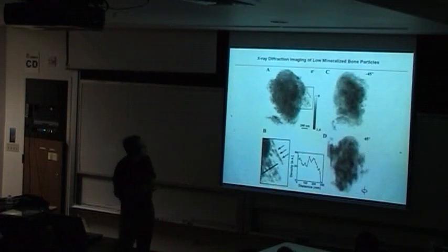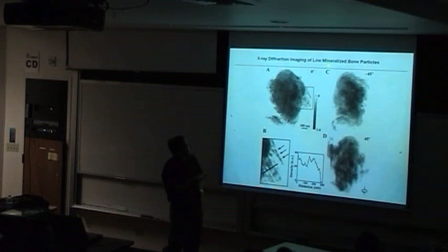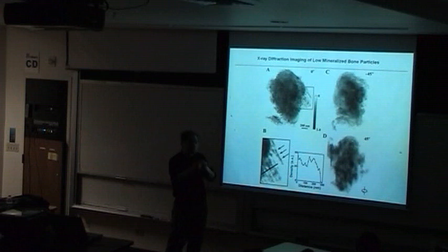We studied X-ray diffraction imaging of a fish bone, herring fish bone, at different stages. This is young fish bone, which shows low mineralization, meaning young age. Our resolution is about 15 to 20 nanometers. If we zoom in on this region, you can see the collagen fibrils. There are some dark spots about 67 nanometers apart, and we believe that's related to a concentration of calcium nanocrystals.